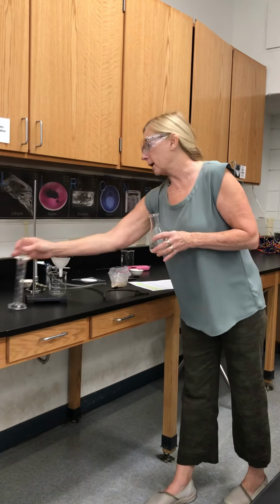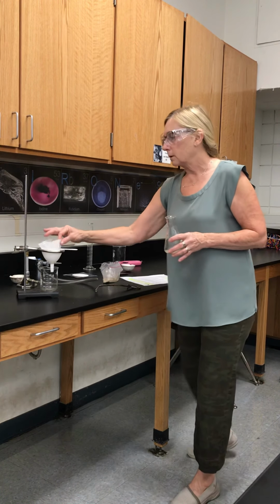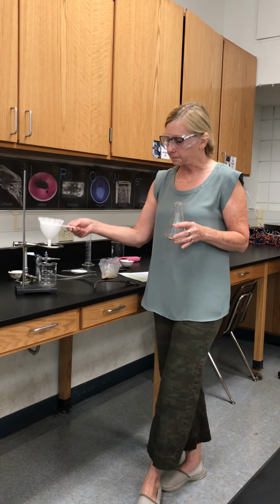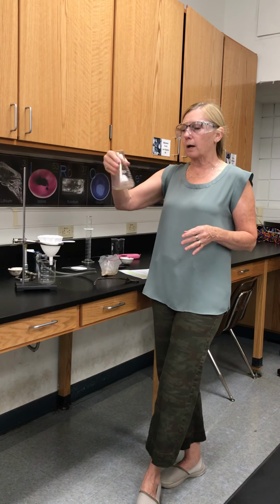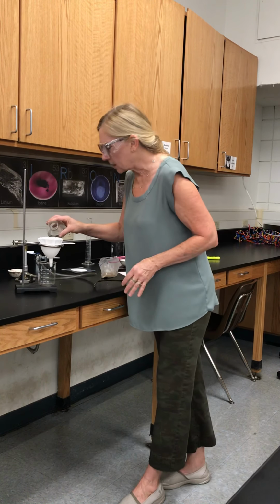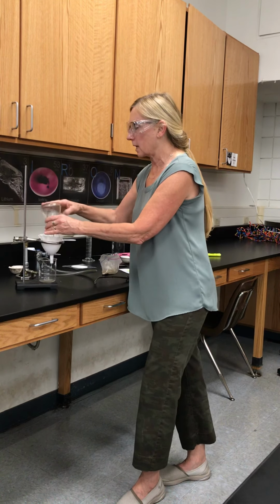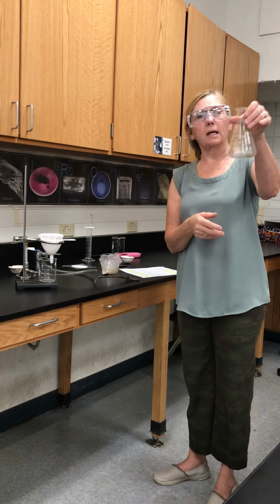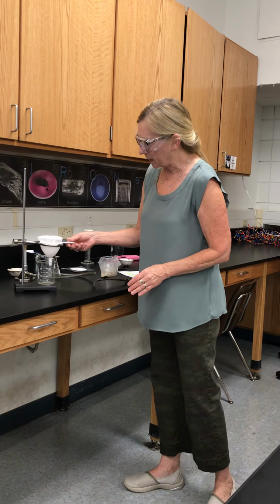Now according to the directions, it says then to get your coffee filter or filter paper, put it in the funnel, in the ring stand over the beaker. So we're going to swirl this mixture of salt, sand, and water around, and pour it right into the coffee filter. I've still got some sand in the end, but we can see that the sand separated out. And we're going to let that drip for a few seconds.